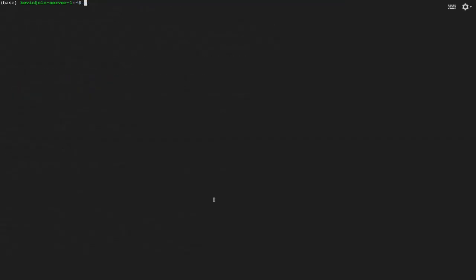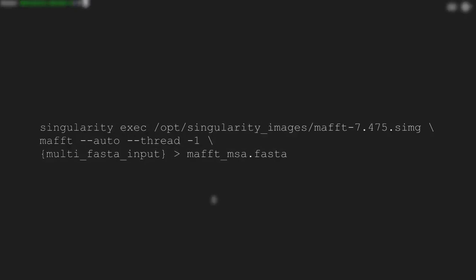The next step is to write a shell script to wrap MAFFT into a single and static executable. To get into this, let's start by defining exactly what command our workbench users will execute when using this external application. For this example, here is how I want my workbench users interacting with MAFFT. When users pull up the MAFFT external app from their genomics server GUI, this is the command they'll be executing under the hood.